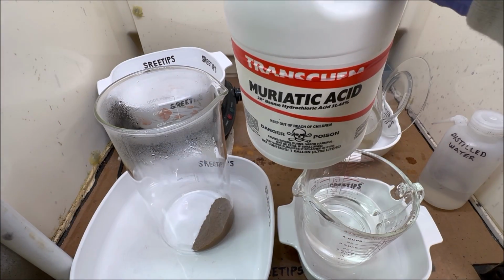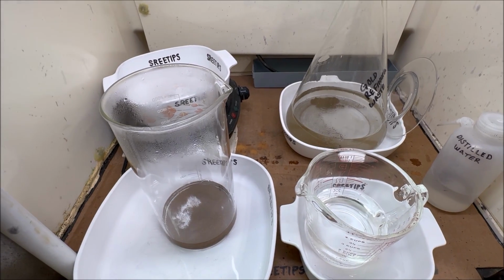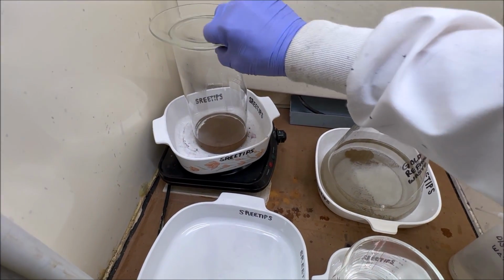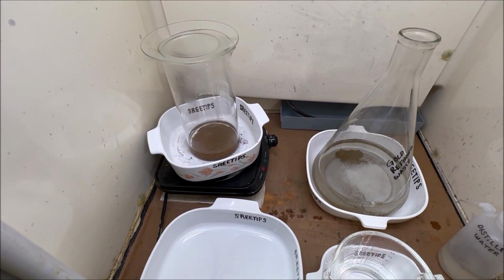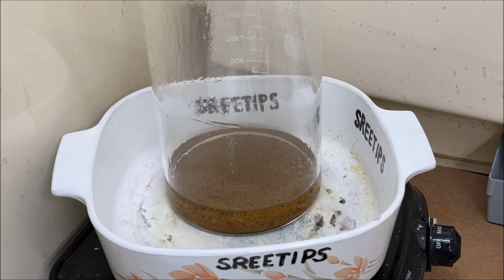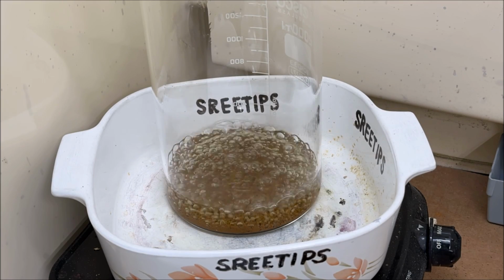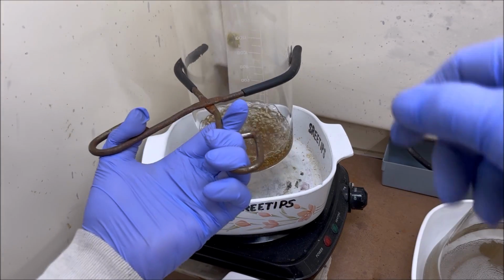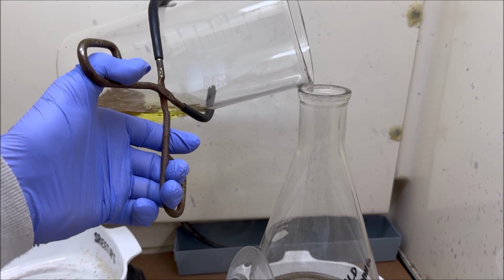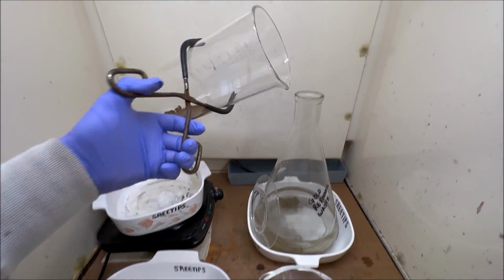I'm adding hydrochloric acid, about 200 milliliters, and we'll put it up here on the heat and boil the gold in hydrochloric acid. The gold has been boiling in hydrochloric acid for about 10 minutes. Now we're going to take it and dump off this hydrochloric acid boil into our temporary waste container. You can see there's some yellow color, which may be some gold in solution. That's okay, we can recover it out of that waste container later on.